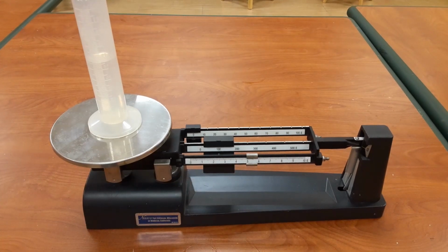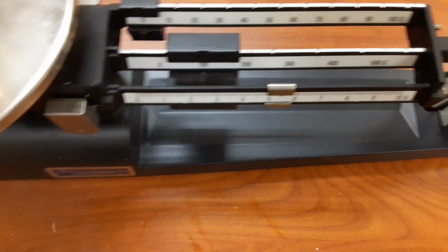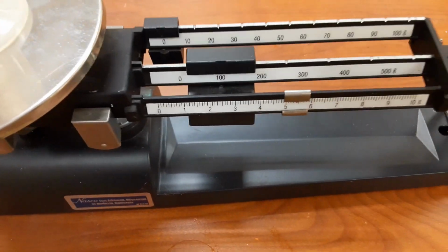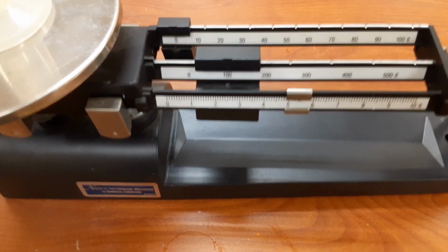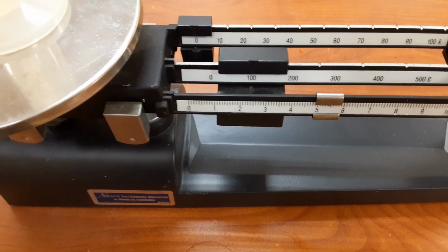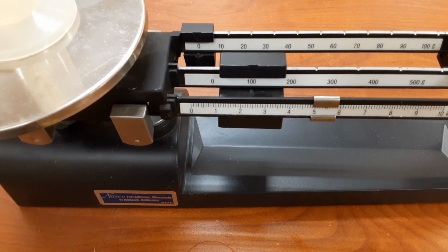And it seems that the beams are horizontal here, and at this point what you can see is that the middle slider is at 100 grams and the back slider is at 0 grams, and the smallest slider is at 5.4 grams. So that means that the mass of the cylinder with the water is 105.4 grams. So please record that. Total mass is 105.4 grams.